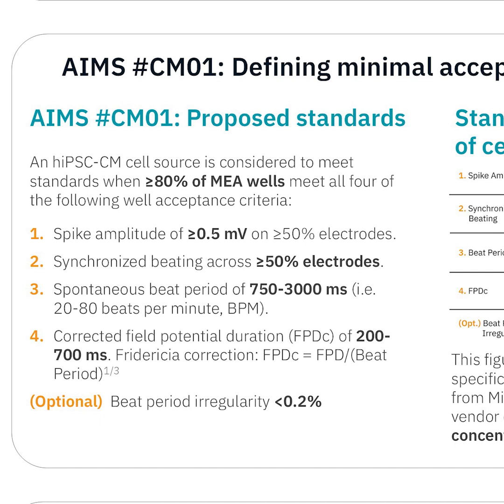However, the rationale for this range was inferred from the SIPA pilot study, which used iPSC cardiomyocytes from 2 vendors with spontaneous beat periods at the 2 extremes of this range. See Miller et al. 2018, Figure 2. Although the spontaneous activity of these 2 cell types differed significantly, consistent concentration-dependent effects were observed for both cell types.